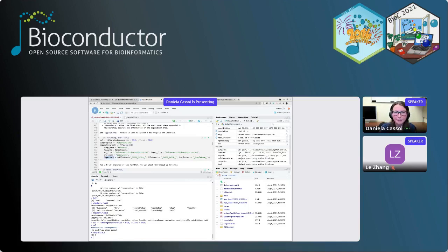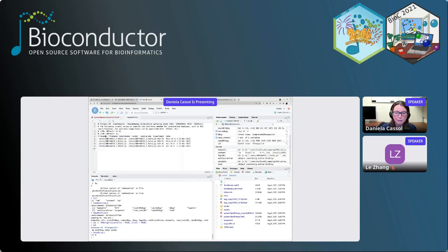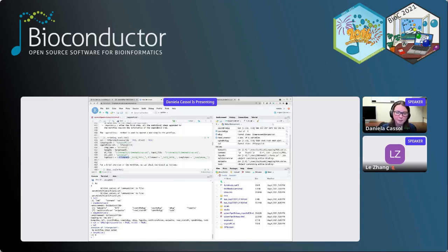The input_vars is where the connection happens between the CWL definition and systemPipeR. What we are taking here is a named vector, and the names of each one of those elements are actually the column names here. So I have FileName1, FileName2, SampleName. That is the information I'm using to build this step. And then the element itself is the variable we define on the input from the CWL. So we make this connection.